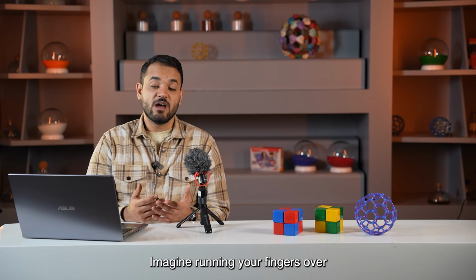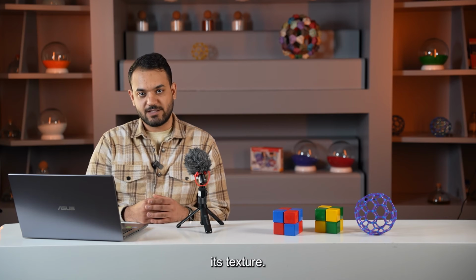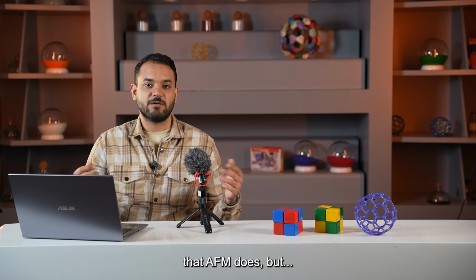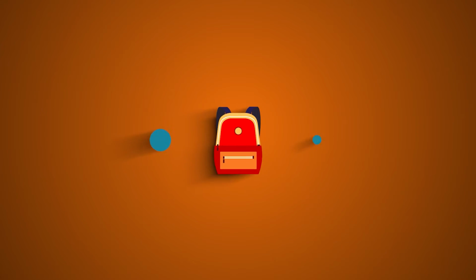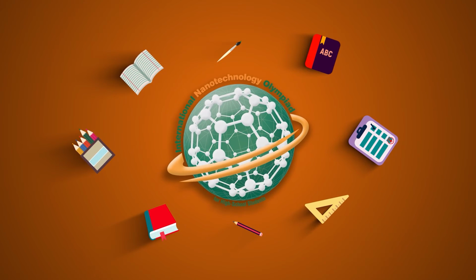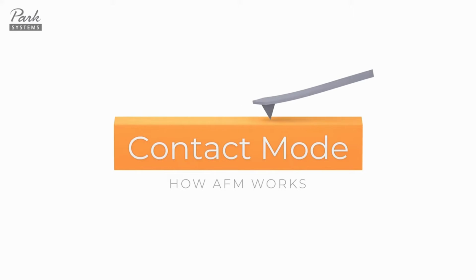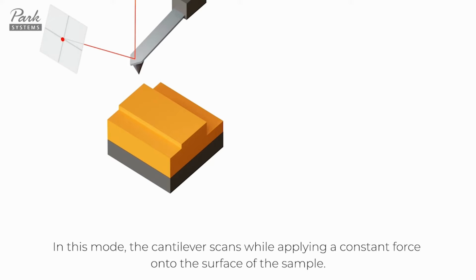Imagine running your fingers over a rough surface to feel its texture. This is the same thing that AFM does, but not on a surface, but on a nanomaterial. So this is how AFM works basically. This mode that it works in is called contact mode, and it's actually the most basic mode of atomic force microscopy.